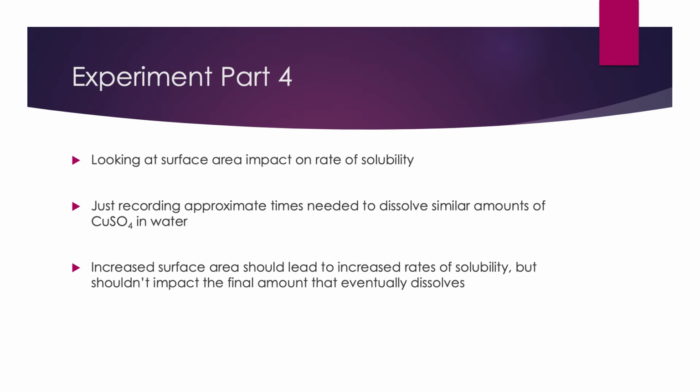That's probably important for this part of the experiment: what you're investigating is the rate of solubility, or how fast something dissolves, not the actual amount. Given enough time, if you add the same masses, they should all still dissolve, or the same amount would remain undissolved out of two different combinations of particle sizes that you're trying to dissolve.